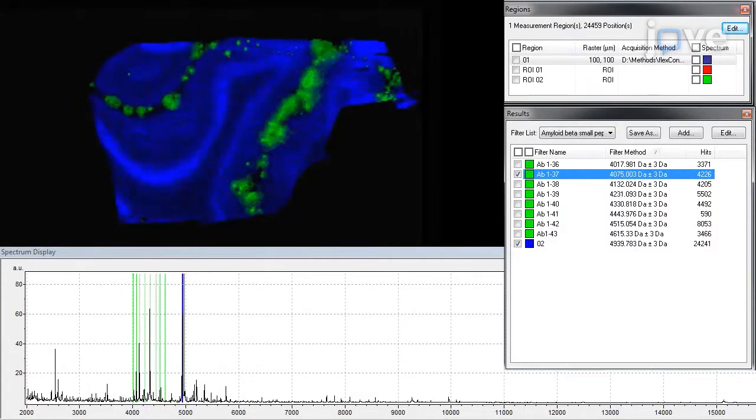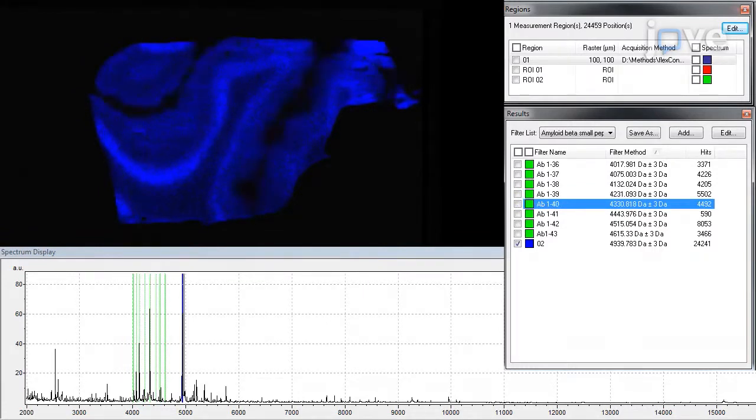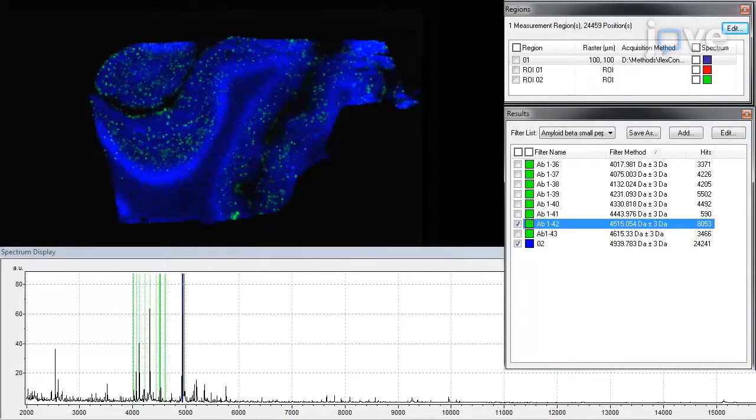Using molecular histology software, overlay multiple signal images to find the spatial correlation of various signals, such as different amyloid beta peptides co-localizing in senile plaques and arterial walls.